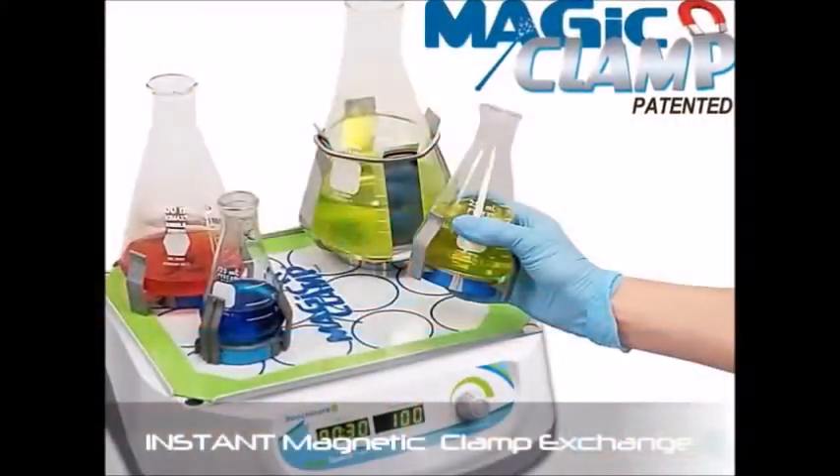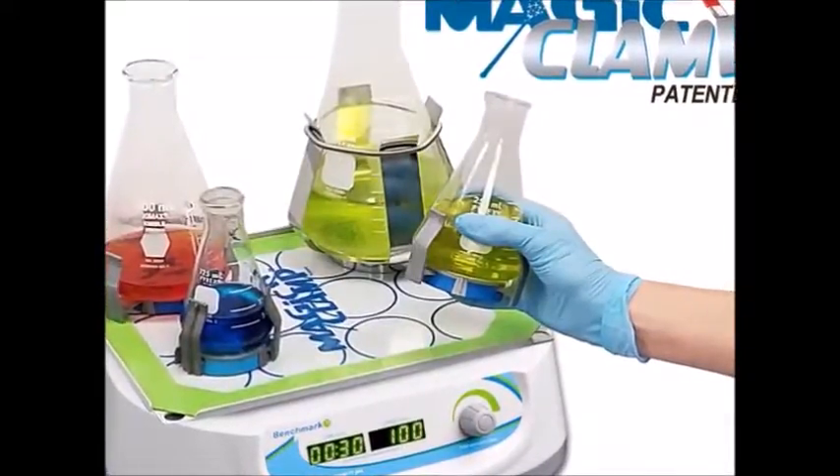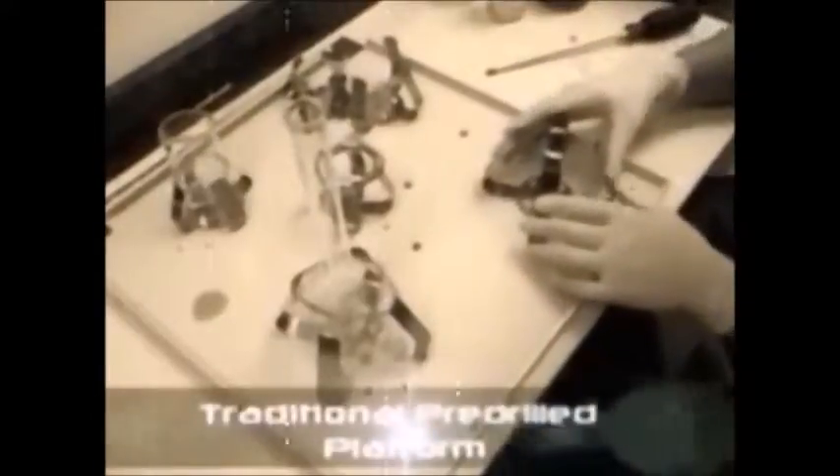For securing flasks and other common laboratory vessels to a laboratory shaker, gone are the days of searching for the toolbox when changing the flask clamps on your old-fashioned pre-drilled shaking platform. The tedious process of lining up a series of holes, locating the correct screw size, and tightening four screws per clamp is a thing of the past.